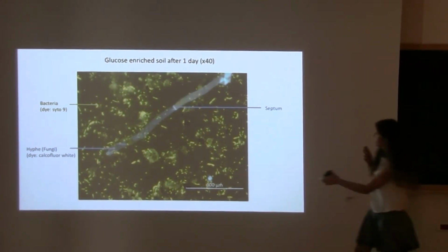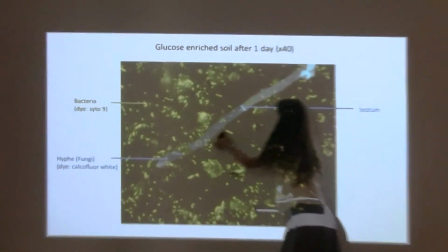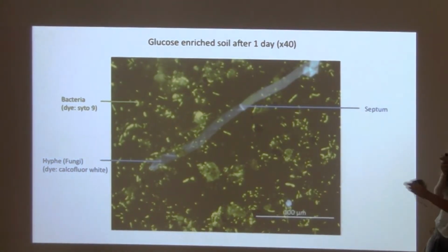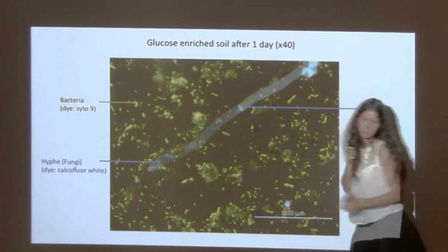And so here you can see a hypha, and you can also see the internal structure of the hypha. So here the septum.